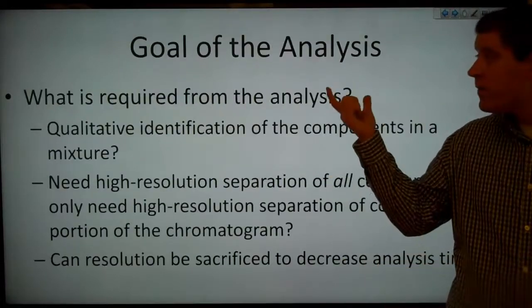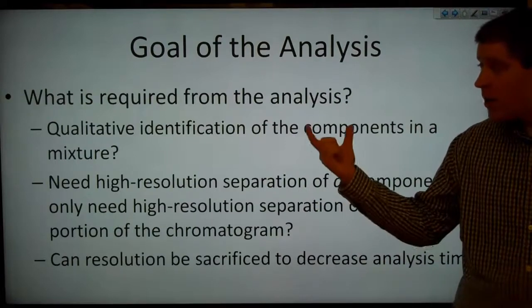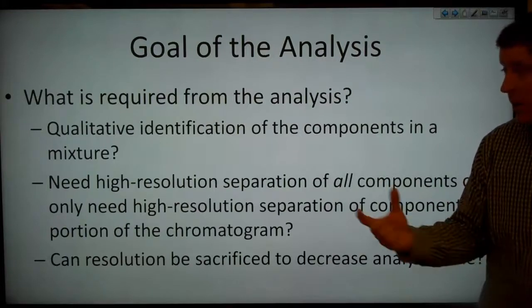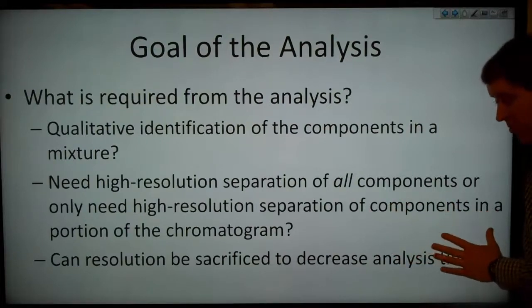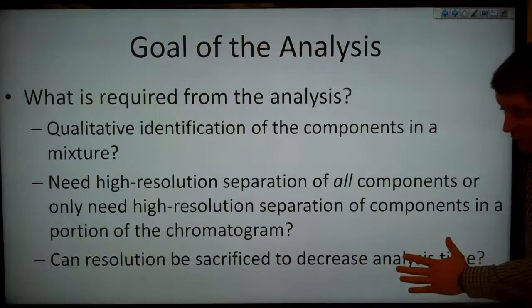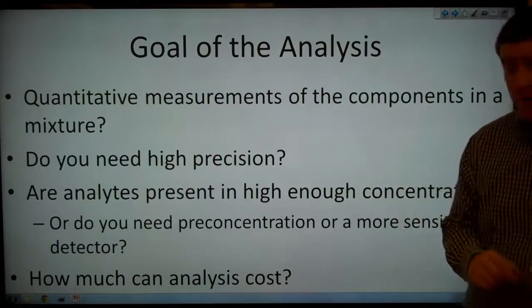So let's look at the goal of the analysis. What exactly is required from the analysis? Do we need qualitative identification of the components in a mixture? Do we need high-resolution separation of all of our components? Or do we only need high-resolution separation of the components in a portion of our chromatogram? Can resolution be sacrificed in order to decrease the analysis time? Do we need quantitative measurements of the components in our mixture?